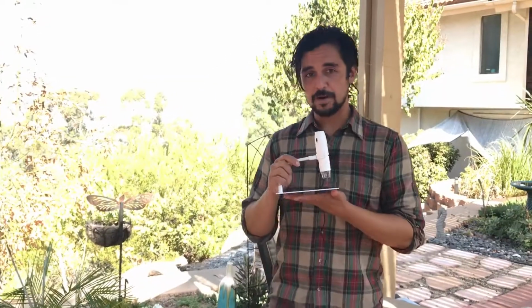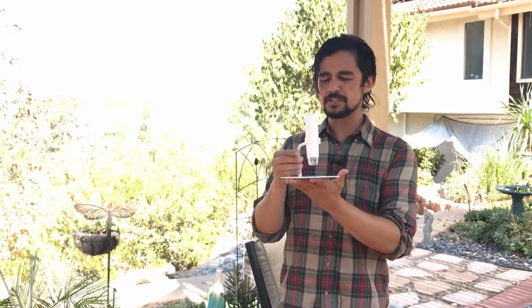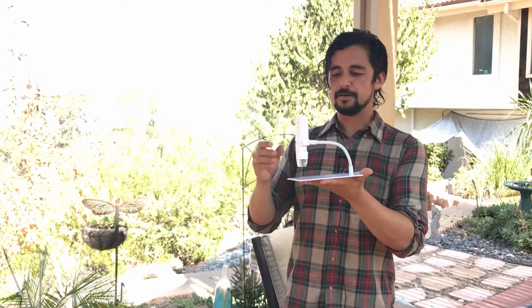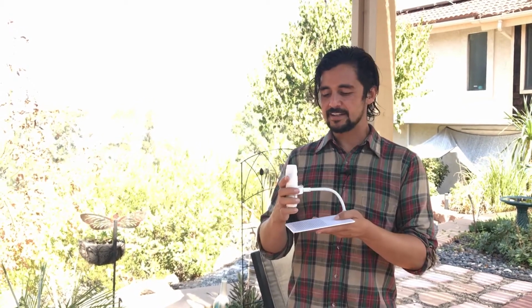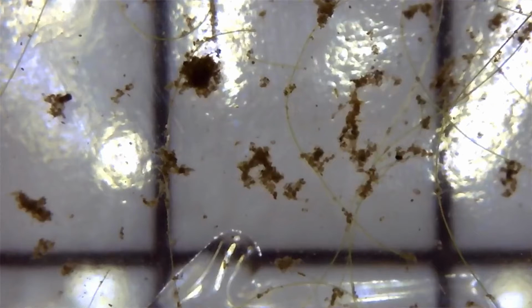You'll need your digital microscope. This is something that you should already have and you should already be somewhat familiar with how to use it. But the digital microscope is essentially a tool that will hook up to your device, iOS or Android, and it'll allow you to look at really small organisms.